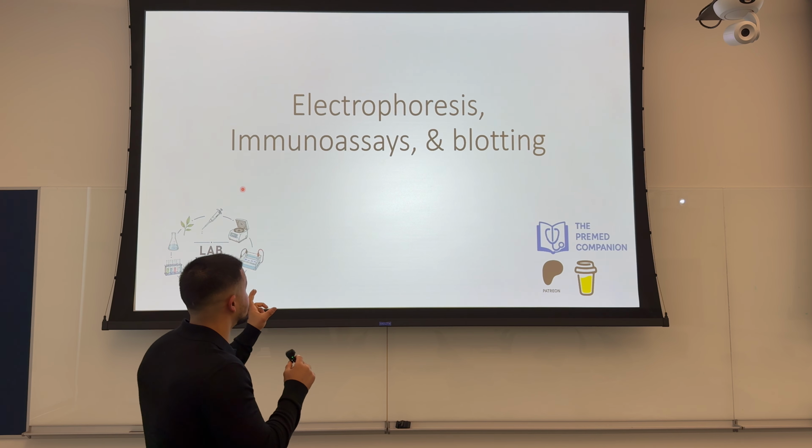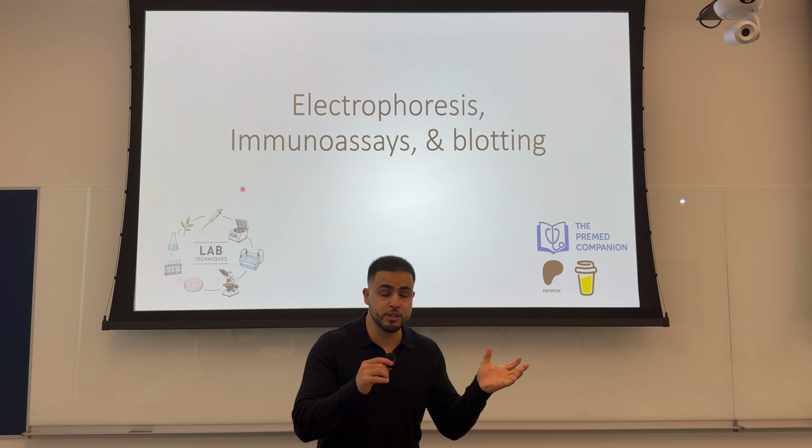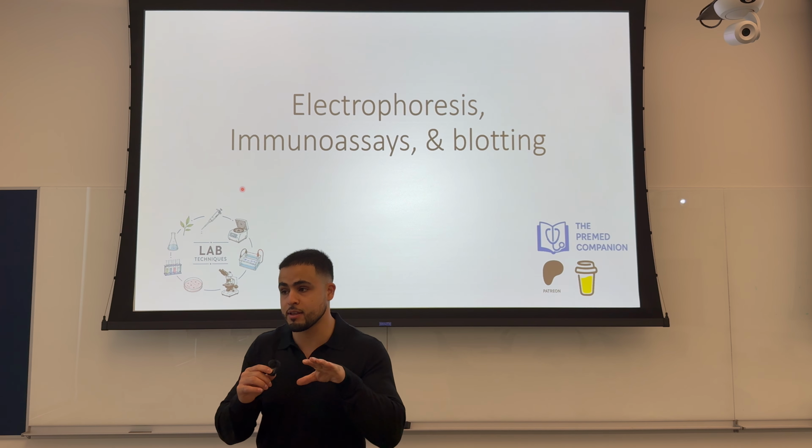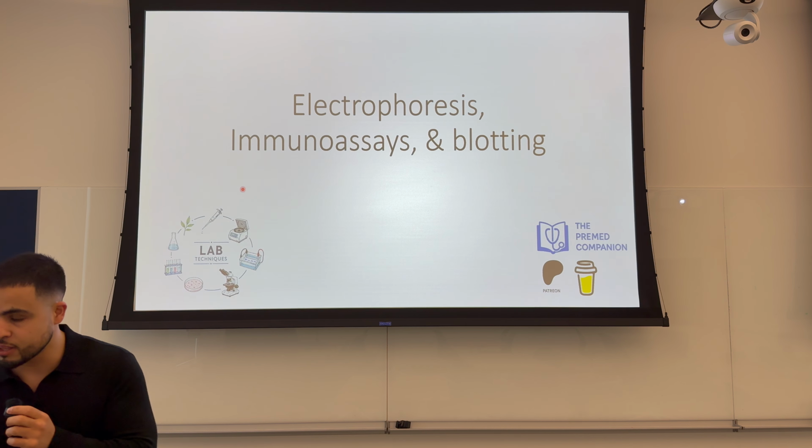Also, there are a lot of subcategories within these broad categories, so if you wanted to jump to a specific lab technique, you're able to do that. I've time-stamped this video. Let us get started with electrophoresis.